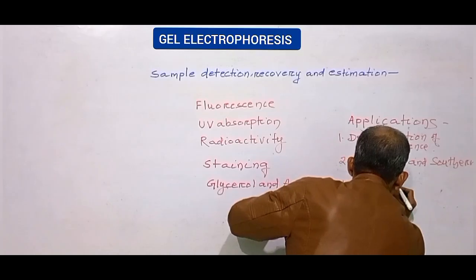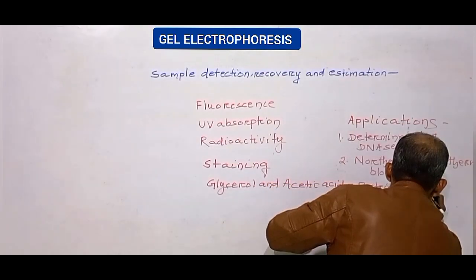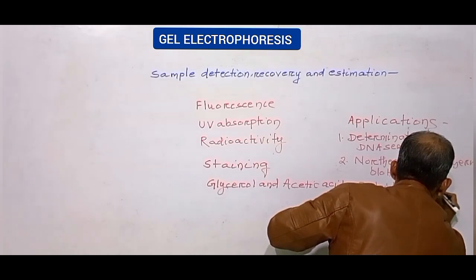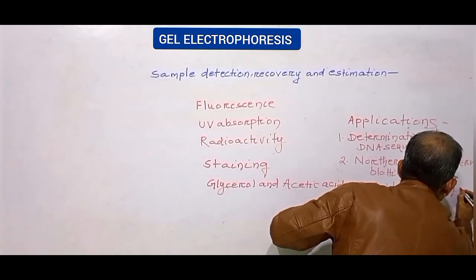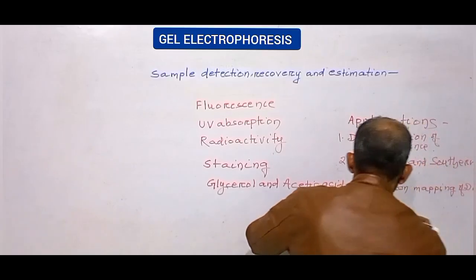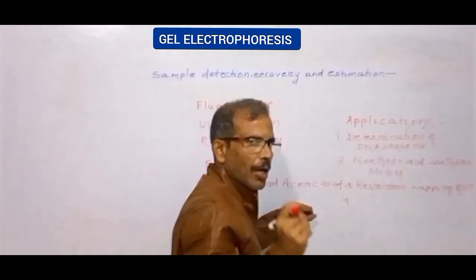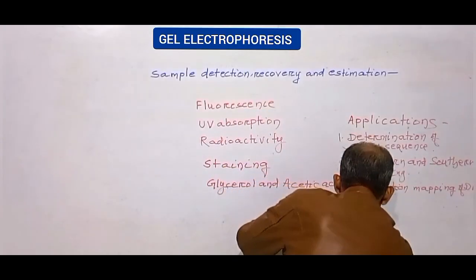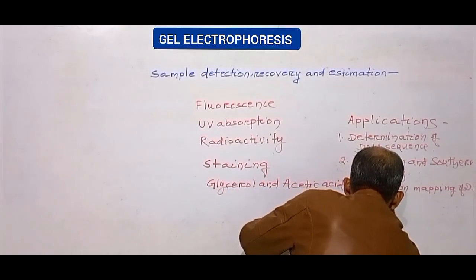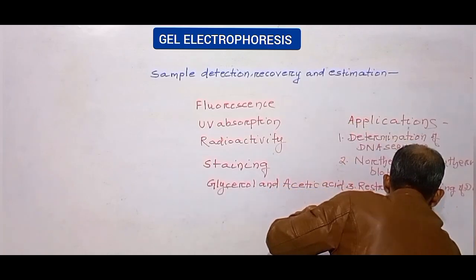Fourth one is determination of subunit stoichiometry.